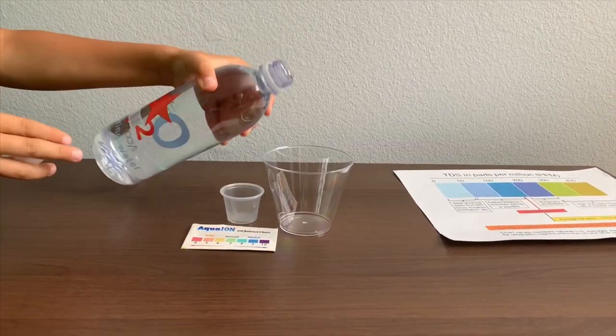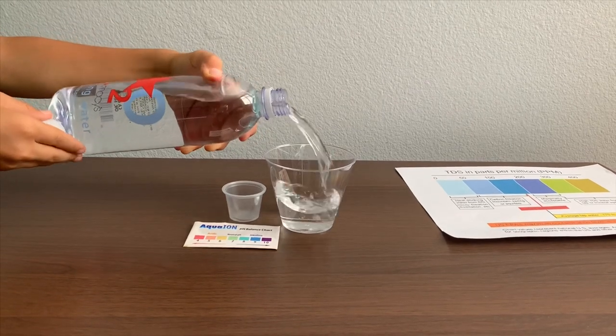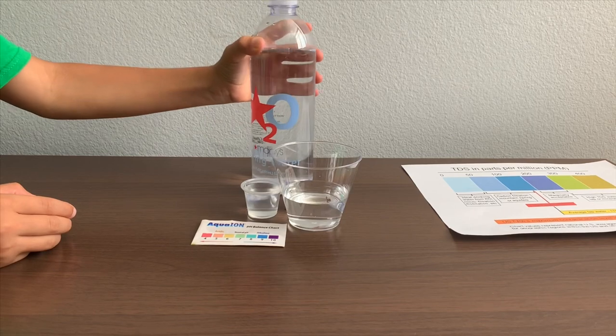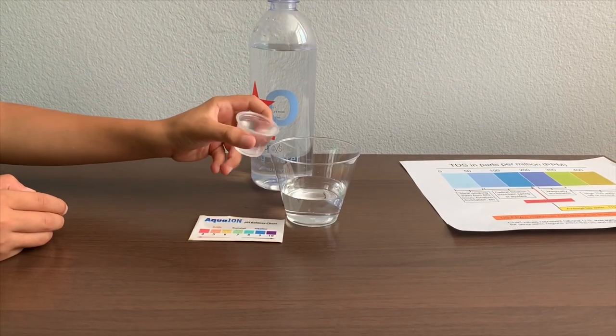Let's pour some water in. This is a little too much for the pH cup, so let's pour some back into the TDS cup.